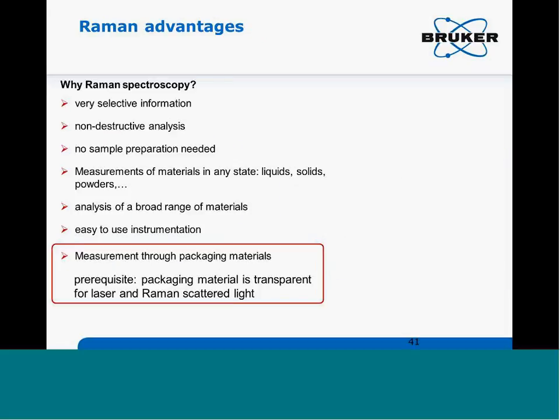Raman spectroscopy has become popular because it's non-destructive analysis and pretty easy to use. You can look through vials and packaging materials with no sample preparation.